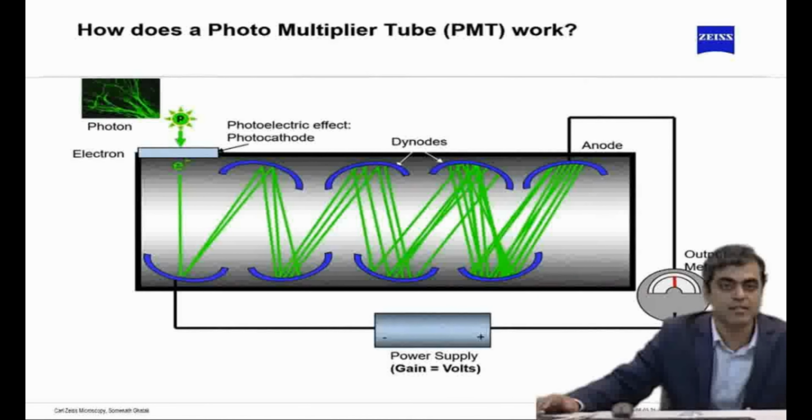Now, in fluorescence, the number of photons which you are collecting is always very less. In the best case scenario, we saw approximately 25% of photons being collected. Now we have to create an image out of 25%, which is a tough job, and that is done by the detector. This is not a normal detector, it is a photomultiplier tube. The photomultiplier tube's role is to amplify.